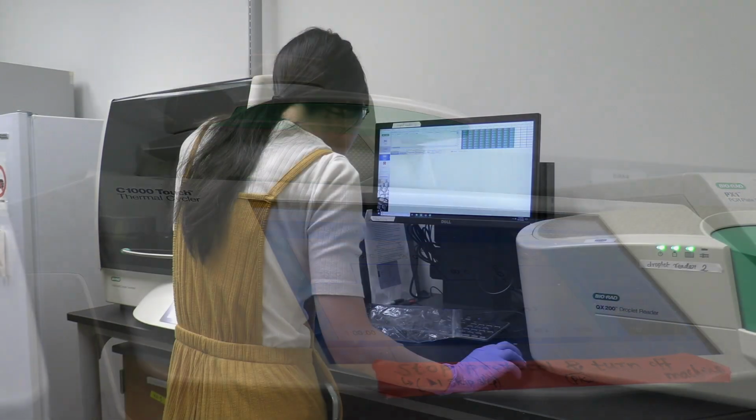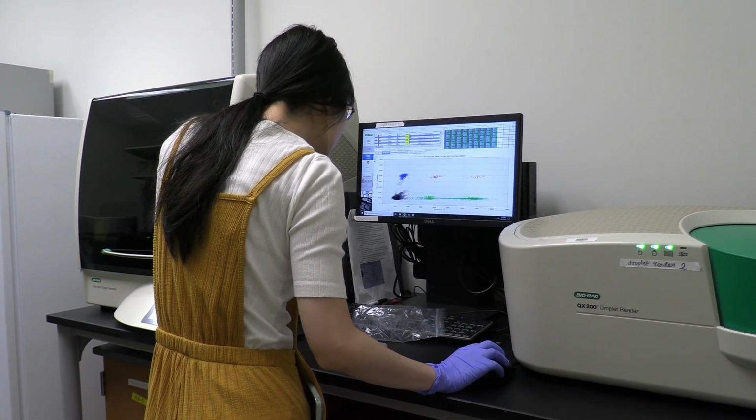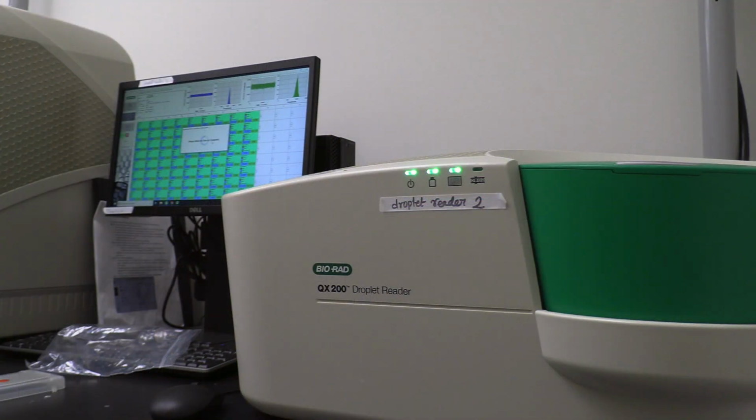Droplet data is then read on a droplet reader and analyzed using QuantaSoft software. The benefits of ddPCR are that it's a sensitive quantification method that is robust to inhibitors and provides an absolute count of target genes without the need for standard curves.